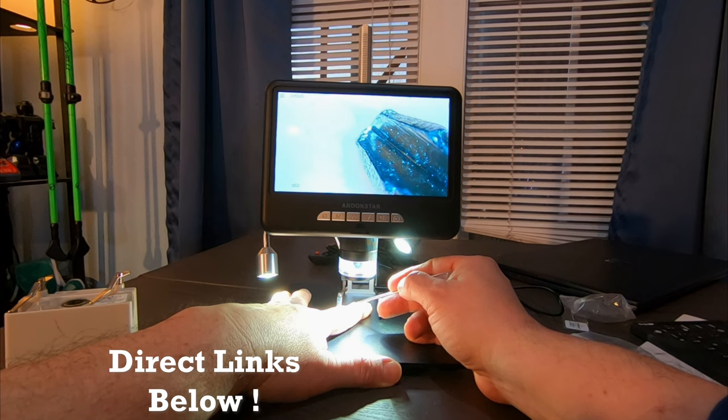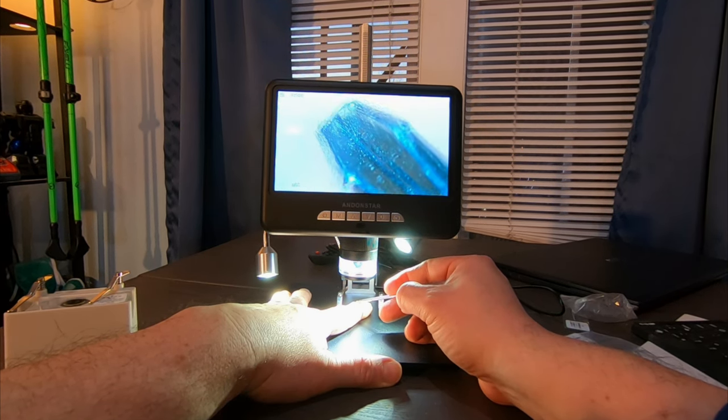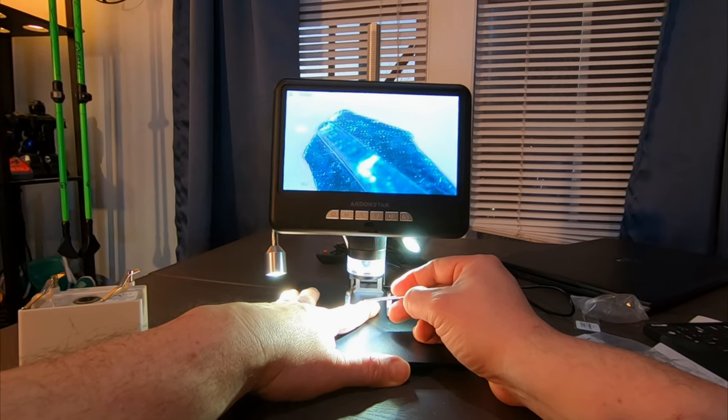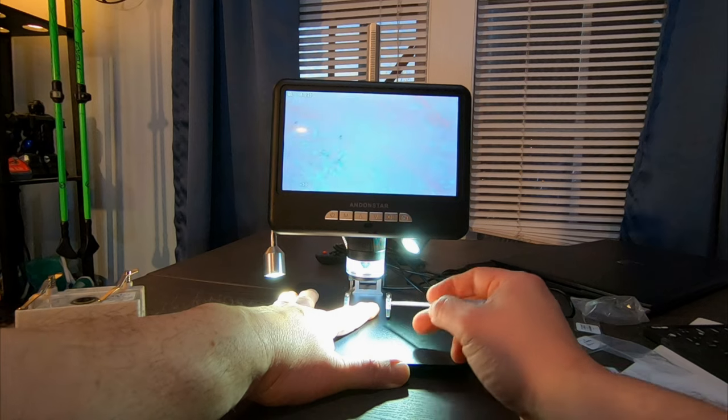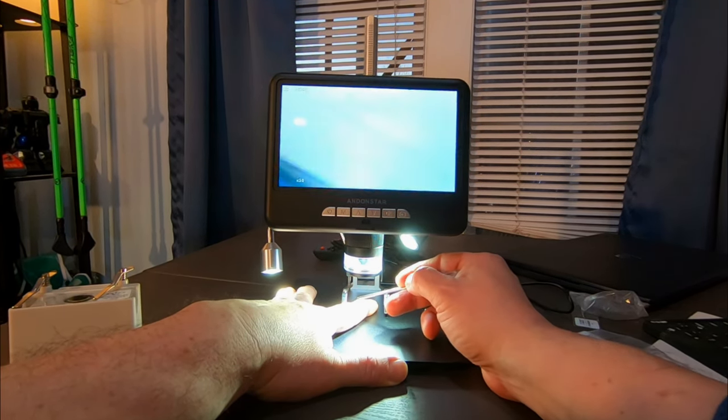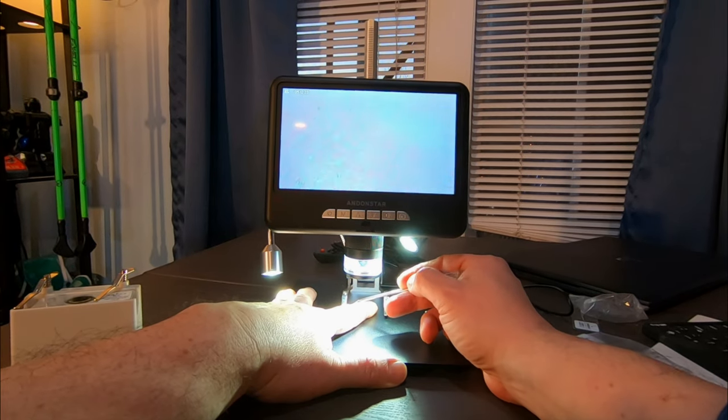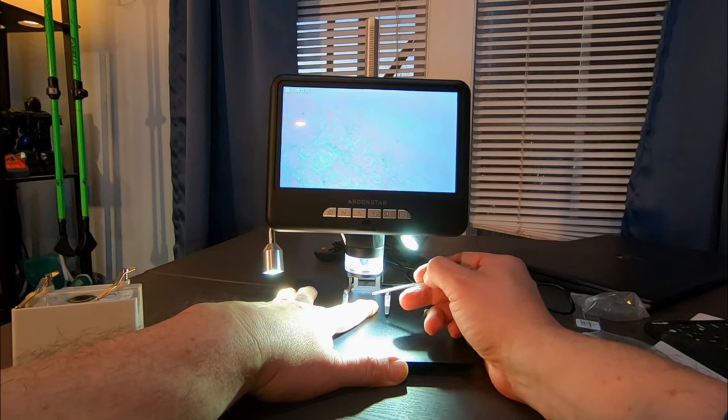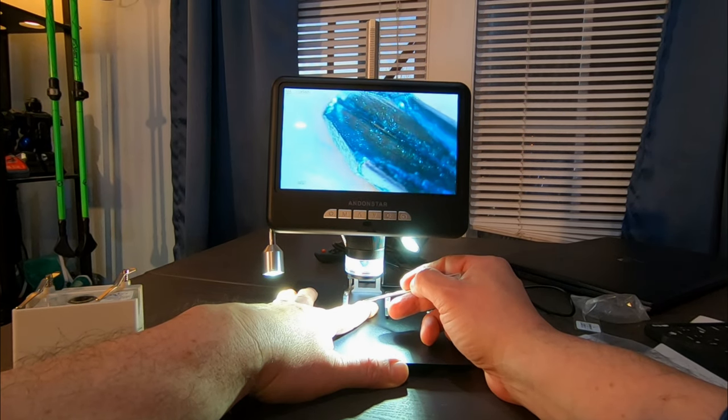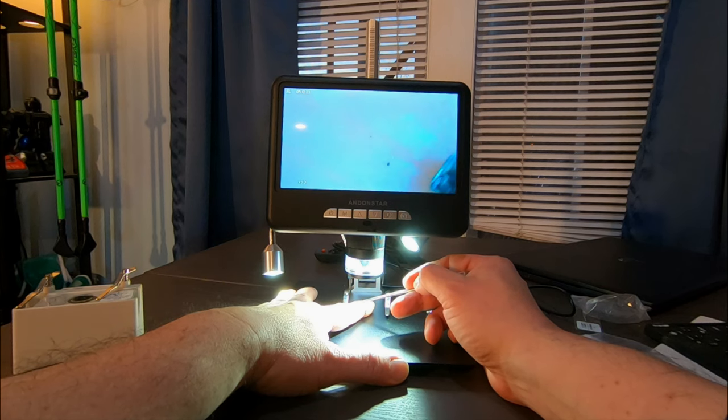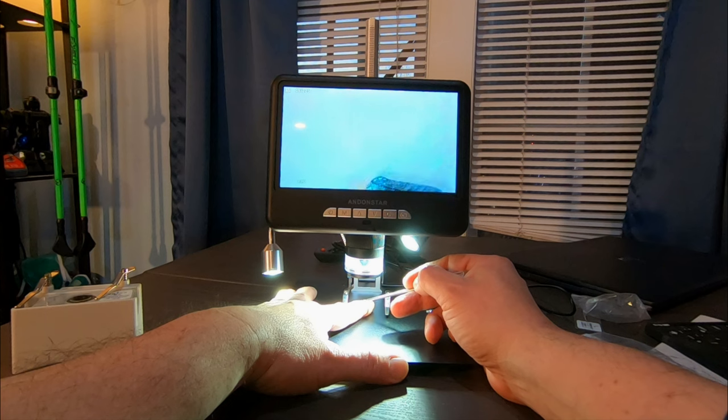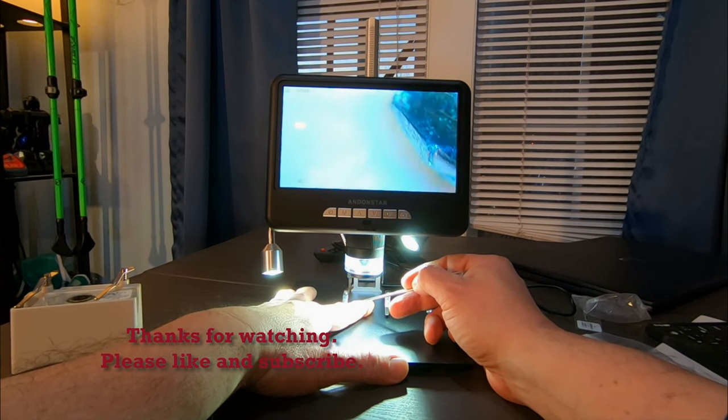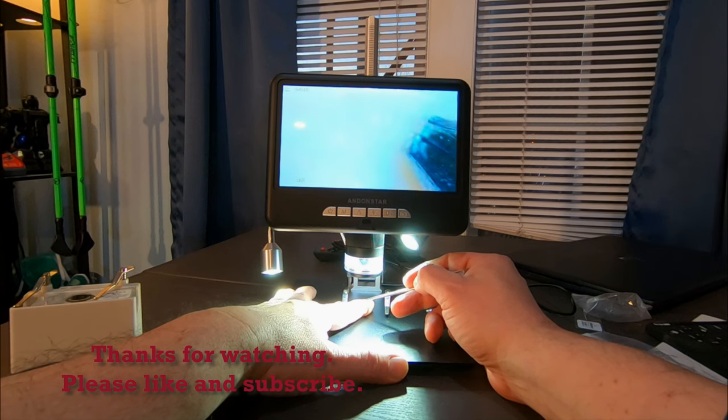That is a trip. Look at that. Oh my gosh. You can really see up close with that part of the screwdriver. That's a trip. Okay. I got to clean. I got to clean this off. Oh, it worked. I think. See, and you can show your kids before and after. That is really gross. Sorry for showing you my skin so close. Look at little microscope. I wonder what that is. Maybe that's just pieces of. Maybe that's pen. Leftover pen. Ink. That's on my skin. Isn't that gross?